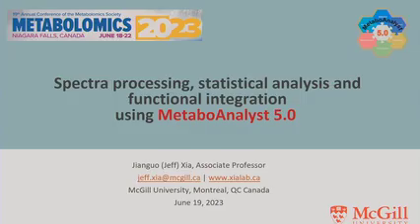So my name is Jeff Xia, and we have developed MetaboAnalyst. It's been very popular, and we keep adding a lot of functions. So today, the workshop, we are going to focus on the latest progress for LCMS spectral processing, statistical analysis, and functional interpretation.